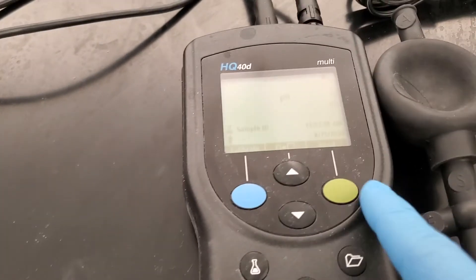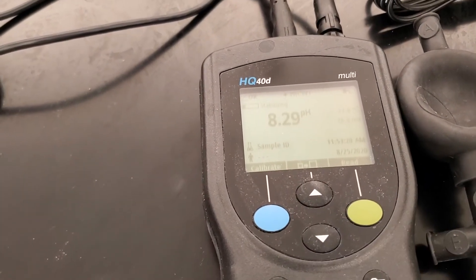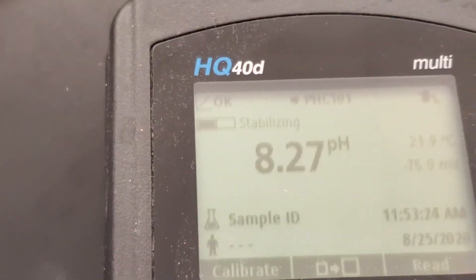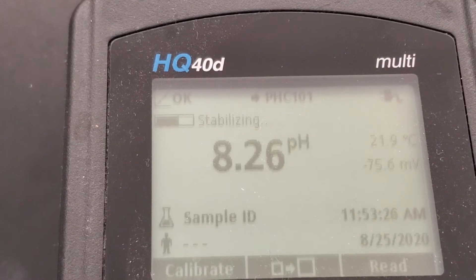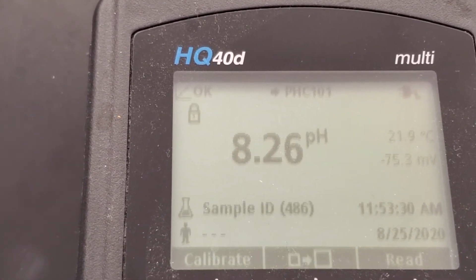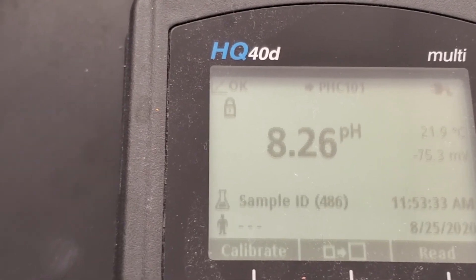Come back here and press read. It's going to display the pH value. It will say 'stabilizing' for a few minutes, and once it stops stabilizing, you can note down the pH. This is the pH for that sample.